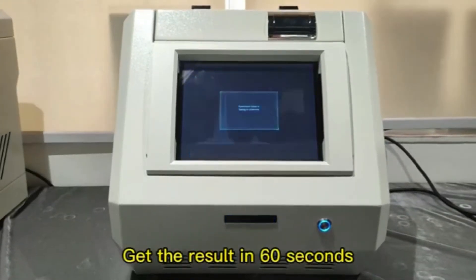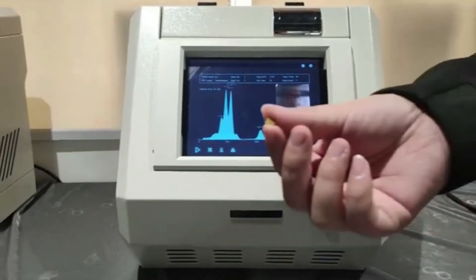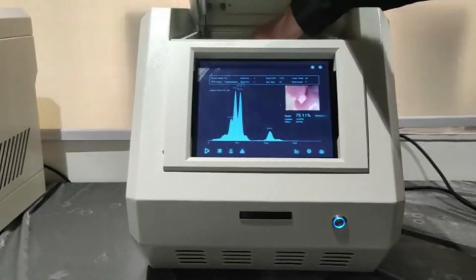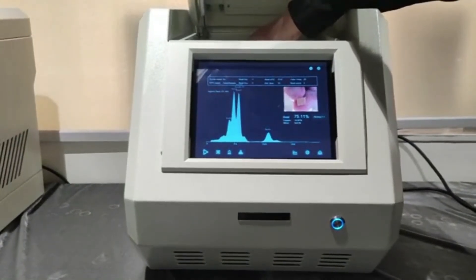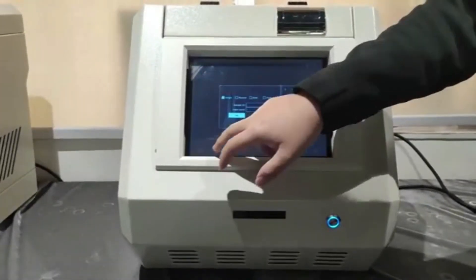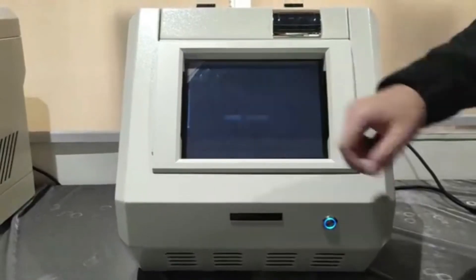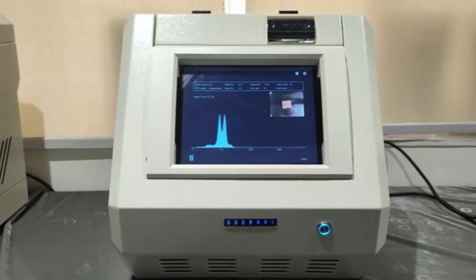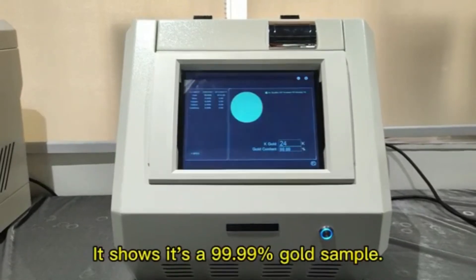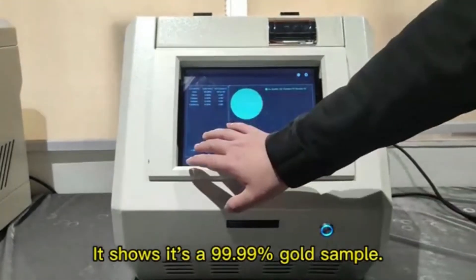Get the result in 60 seconds. Test the gold sample. It shows it's a 99.99% gold sample.